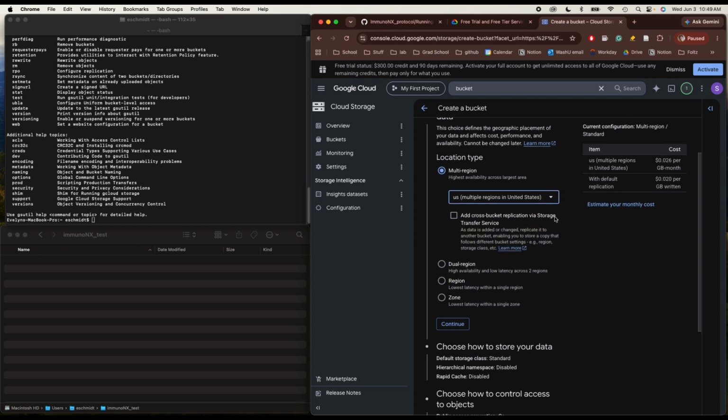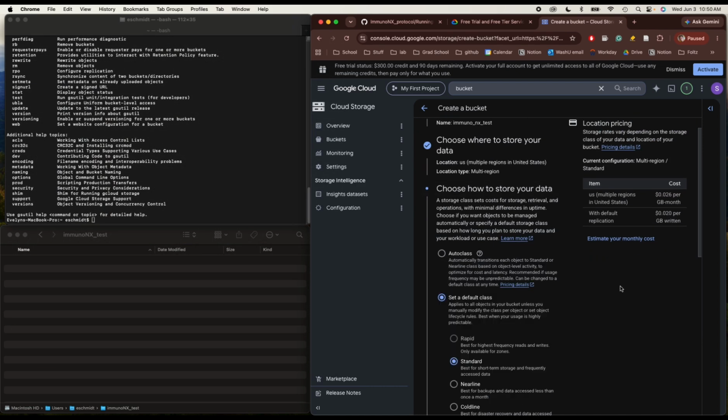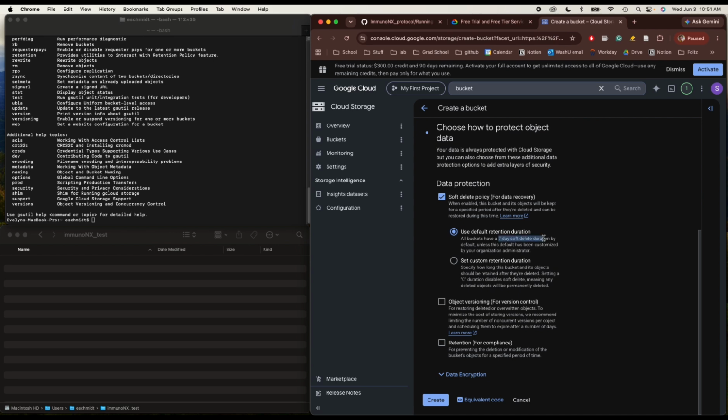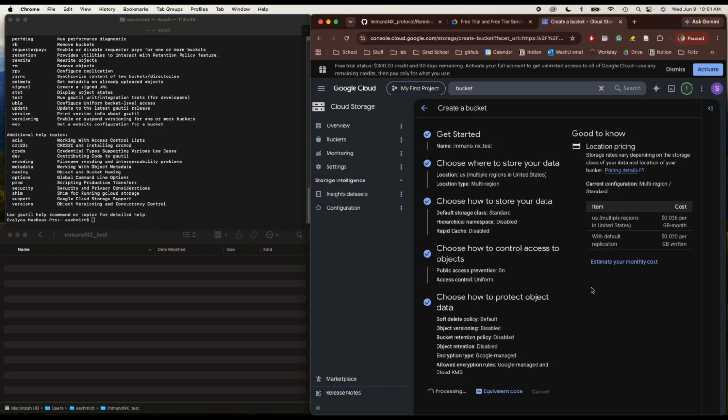And we're going to click US. And yeah, that's what we'll choose. We'll basically set everything pretty basic. Make sure it's not publicly accessible.